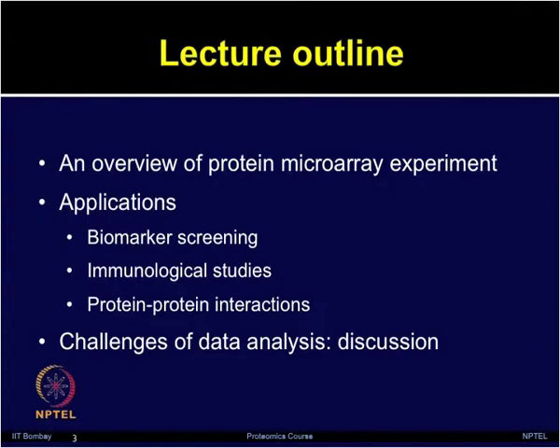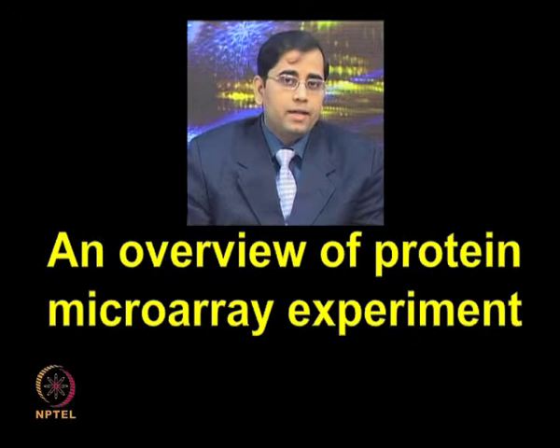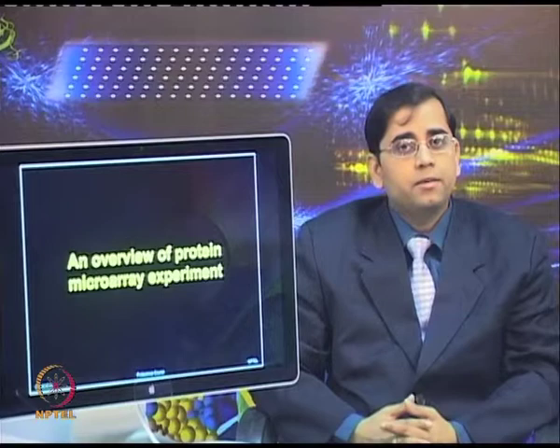So, let us first start with an overview of a protein microarray experiment. Regardless of what application one wants to probe on the protein microarrays, there is a certain workflow which needs to be followed to perform such experiments. Whether you have a cell based or a cell free platform, you need to perform certain steps. But if you are using the cell free based protein microarray setup, then you have to perform certain additional steps. The additional steps include synthesis of proteins on the chip first of all, and then all the steps, regardless of whether it is cell based or cell free, remain the same.